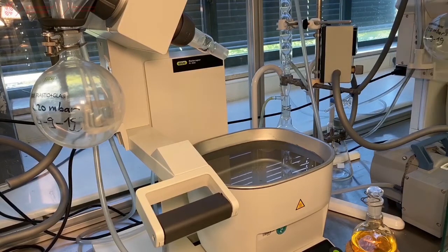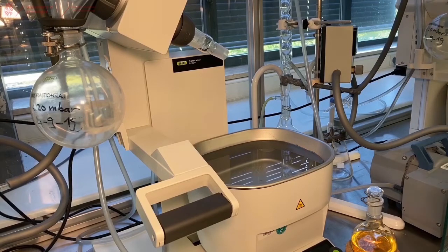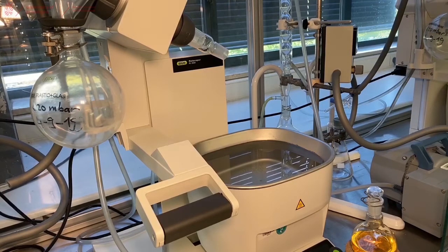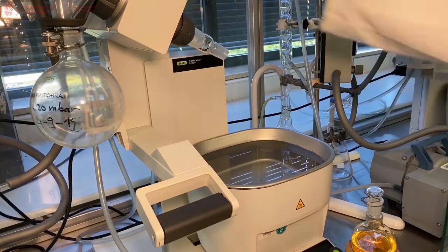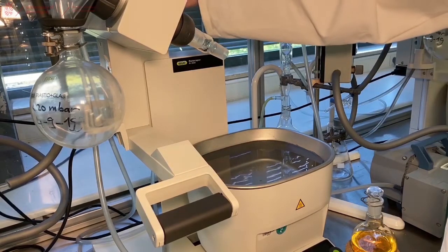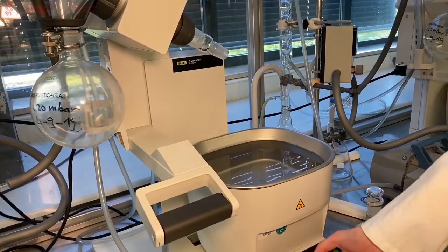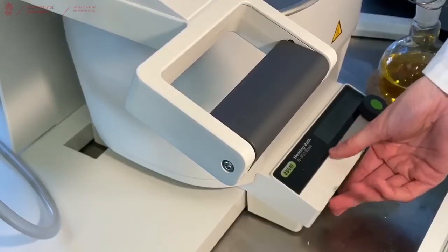Now that the water is on, we have to turn on the Rotary Evaporator. Most of them have multiple on buttons that you can find either on the top or at the bottom of the Rotary Evaporator. This one has one on the top and there is the on button for the water bath at the bottom.